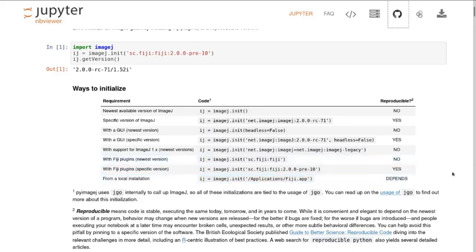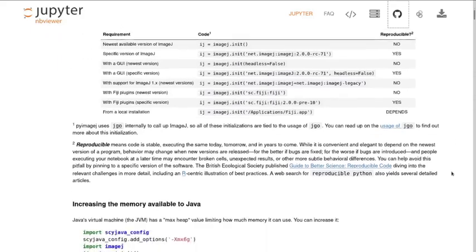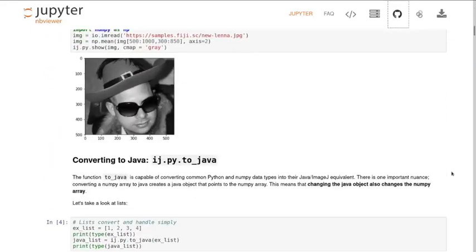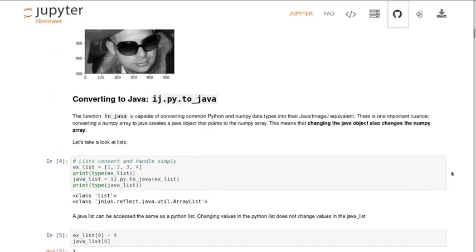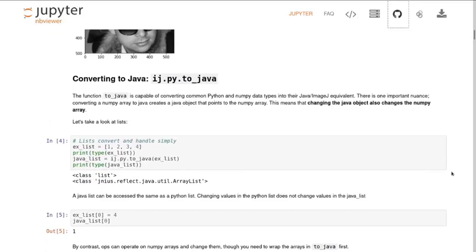Apart from that, really, I want to highlight two features about the way PyImageJ works, and then I'm going to talk about how you interact with developmental packages in general. The first one is because Python is Python, and ImageJ is Java, you have to do a lot of this. Py to Java, and if I scroll down because you've not got this loaded, also there should be Py from Java.